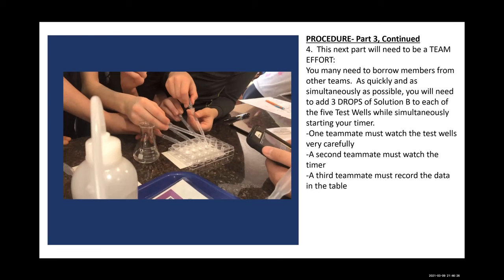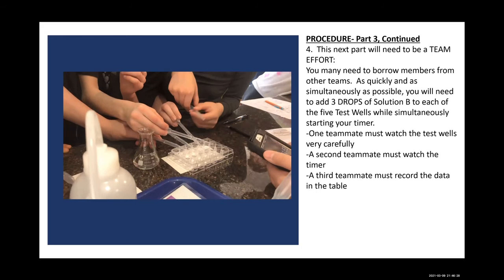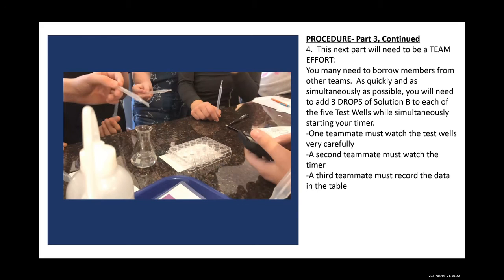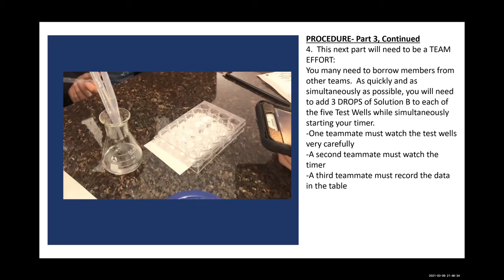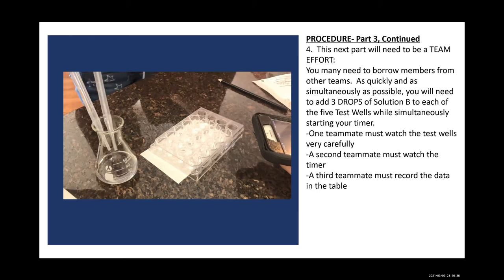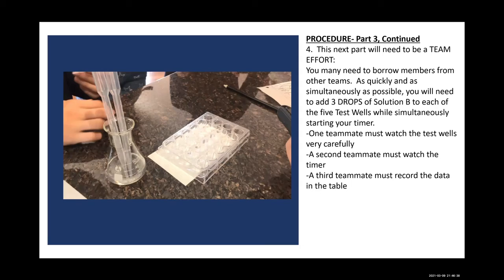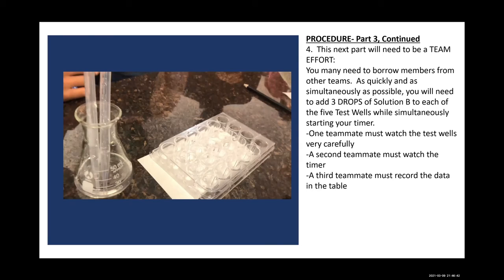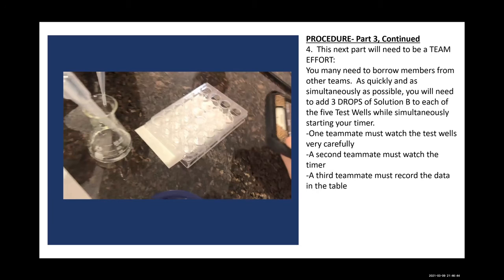1, 2, go. There. I don't think I put my last one. Way more than 3 drops. No, I put 3. No, we put 3. He told me he put 12 in ours. I'm pretty sure he just dropped it all and didn't count. That one's turning, I'm gonna say 7.